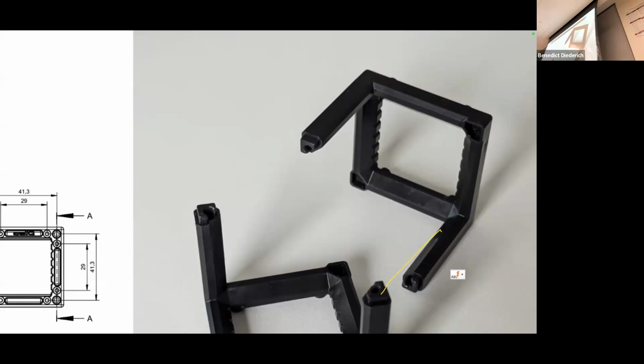Then a portion of it goes here, which is like 50%, and 50% goes down that way. Once I put yet another mirror here, which then has 100%, and another one that has 100% here, the beam, or like the stuff, is basically going backwards. So same as here. What's happening afterwards is the same as what happens until here. 50% goes, 50% goes there.